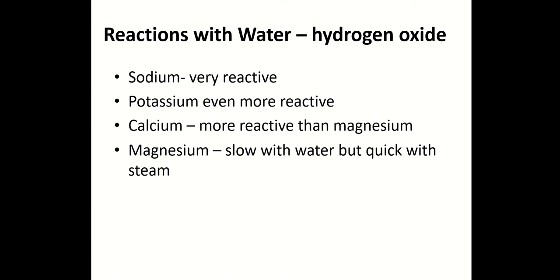Magnesium, as we said, was very slow with cold water, but then in our last video we saw that magnesium reacted really well with steam. It caught fire when you put steam onto it, and it reacted really quickly. So magnesium, although it's less reactive than calcium, is more reactive than hydrogen. So we're starting to put it in between those two in the reactivity series.